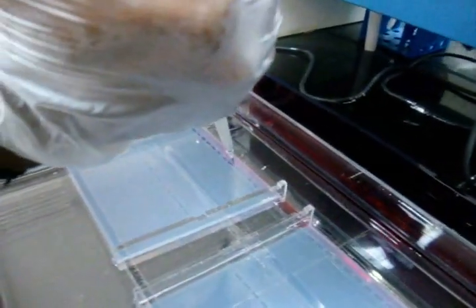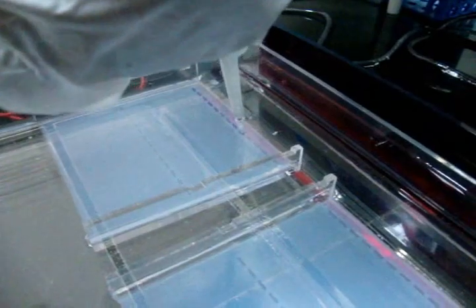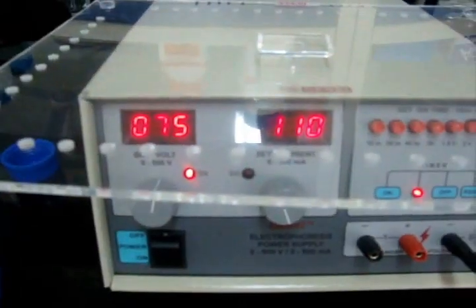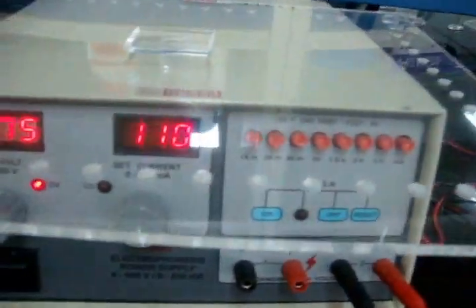Now load the samples into the well. The gel is run at 75 volts for 2 hours.